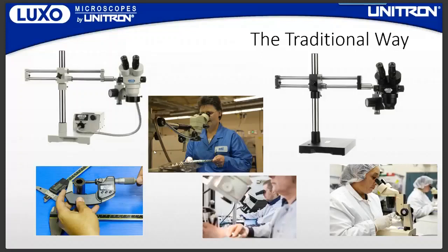Stereo microscopes are great, they're reliable, and they last forever. However, they're not very ergonomically friendly. They usually lack the ability to take pictures or capture measurements very easily, or even compare a live sample against a benchmark or a golden sample. And they're not calibrated either.